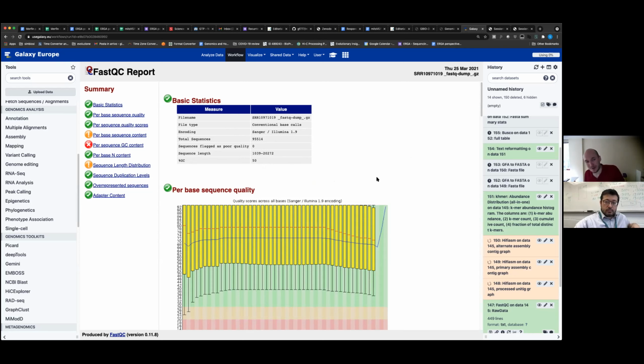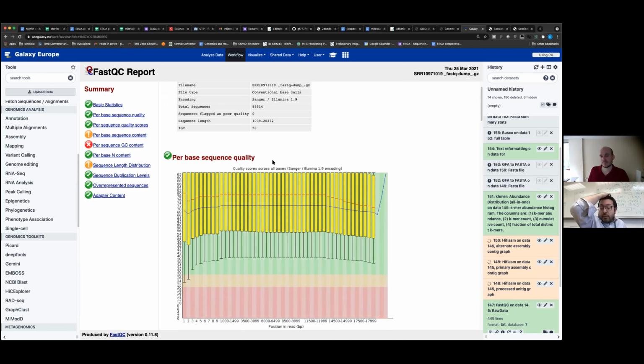Well, I don't know, Olivier, is that a typical run? Yeah, I don't know. That seems short, but also here it's a relatively old data set, so they're not aggressively size selecting. It's 1 KB to 20 KB. Yeah, the small stuff is still in there, it seems, but here, of course, it's a range, so we have to look at the distribution. To be honest, I never run FastQC on HiFi data. But anyway, the GC content is 50%.